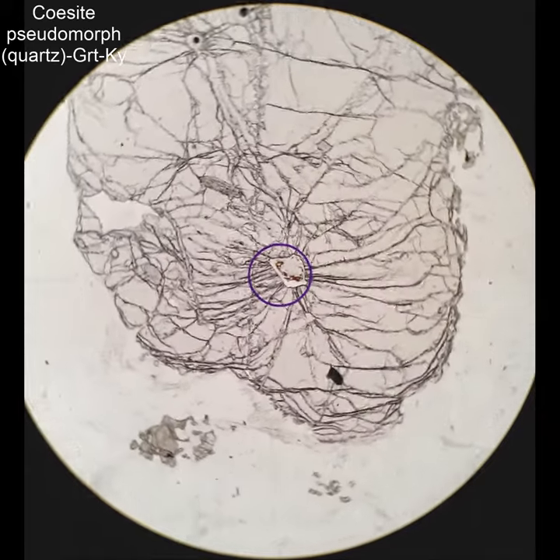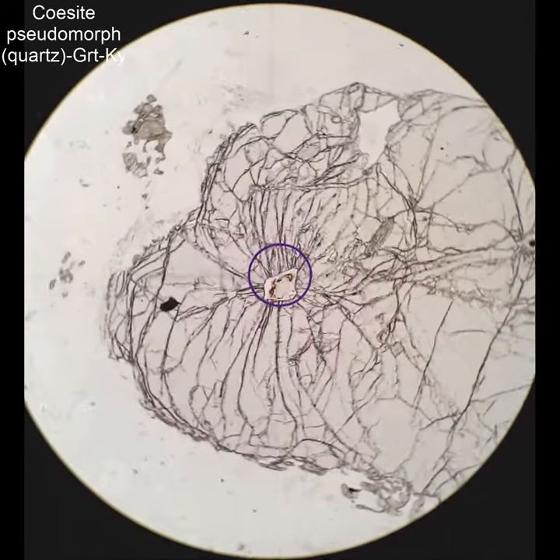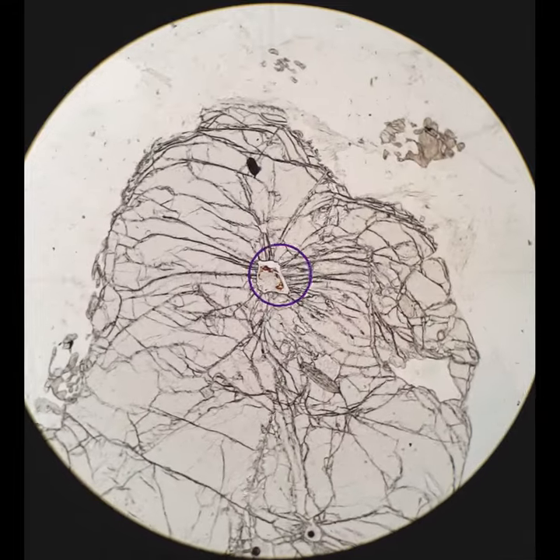I don't have coesite here. Rather, this is a quartz pseudomorph after coesite.